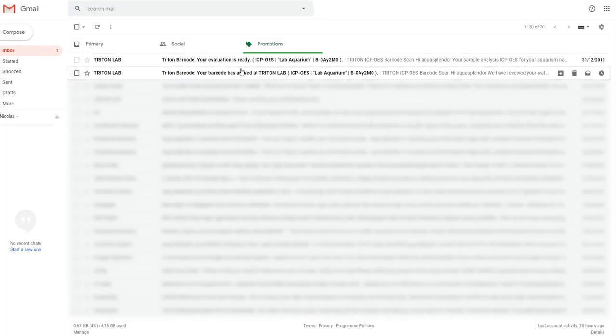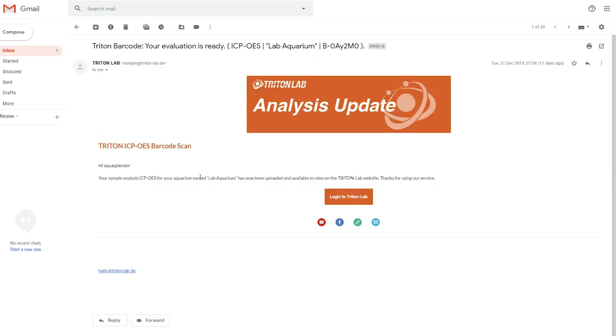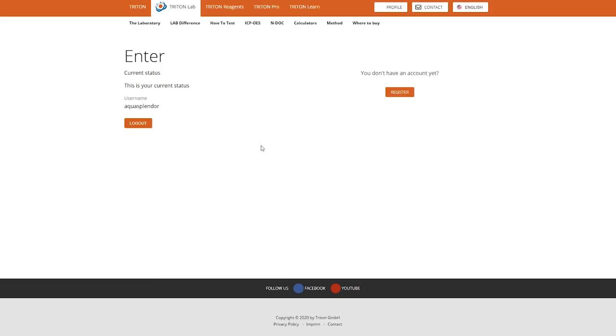Right, so after you ship it to Germany, you're gonna receive an email that says that they received your sample, and after 2 or 3 weeks they're gonna do the test. And indeed, after a couple of days during the holidays, I received the second email saying that the sample has been tested. So I just press login, and I go to change the language.